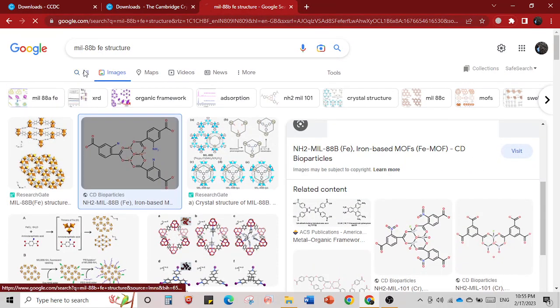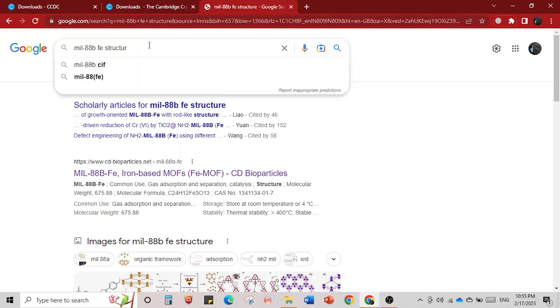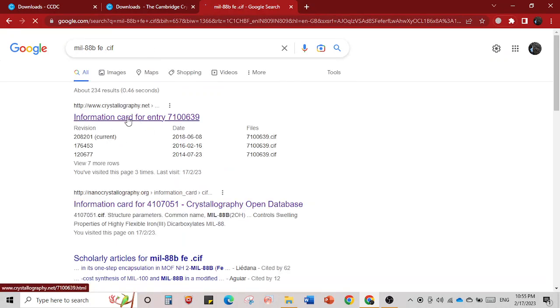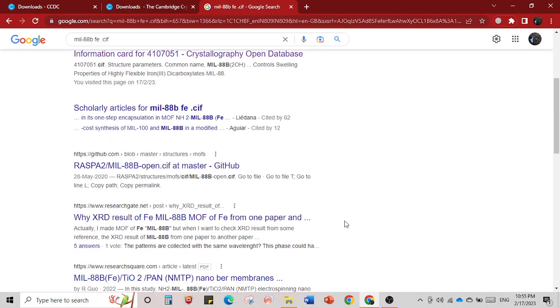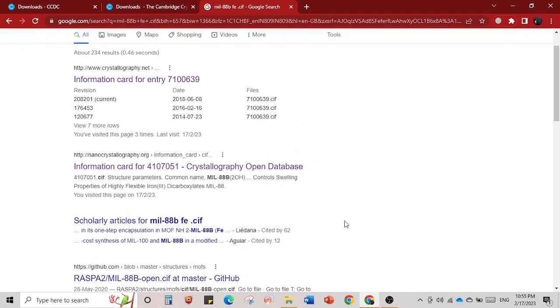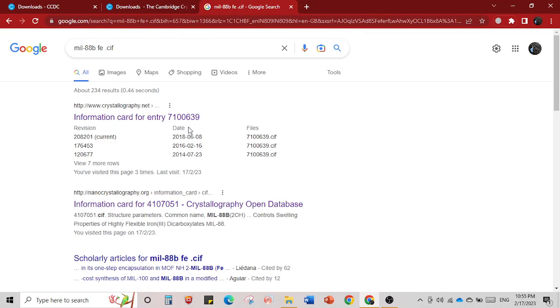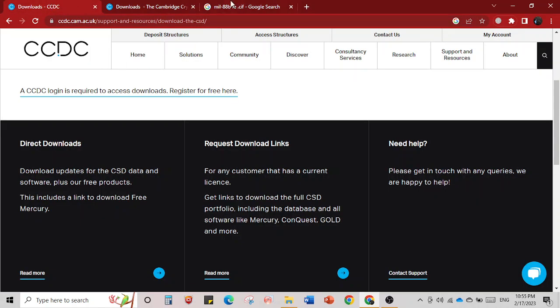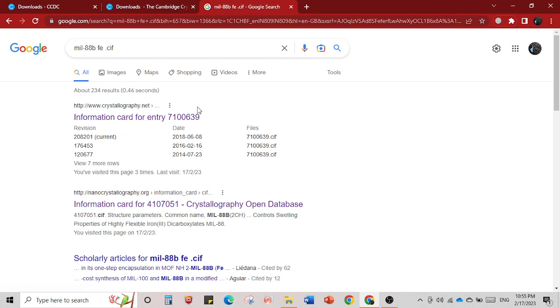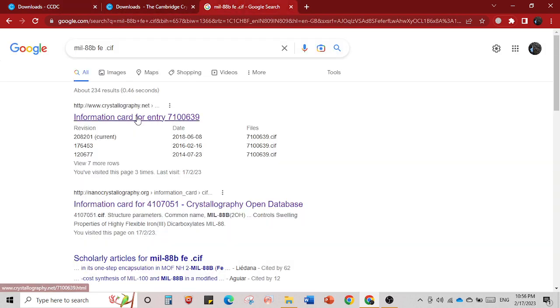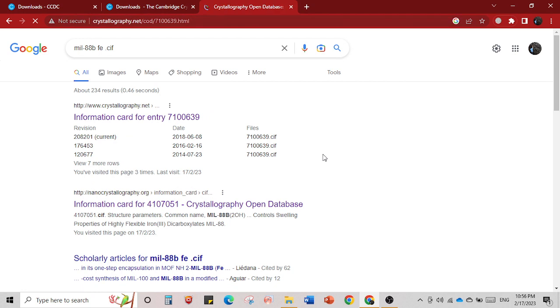Now we will search for the CIF file. Type the name of the MOF and then type '.CIF' and click enter. The first result is crystallography.net and the second is nano-crystallography.net. I would advise you to use these two, or the officially reported paper. If crystal data is available in the paper you download that, or you can also go to the CCDC database and find it there.